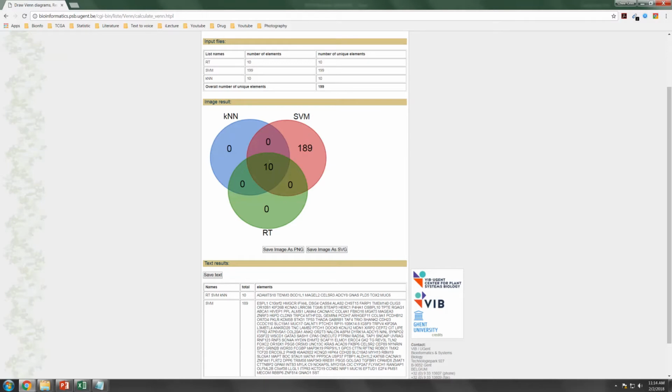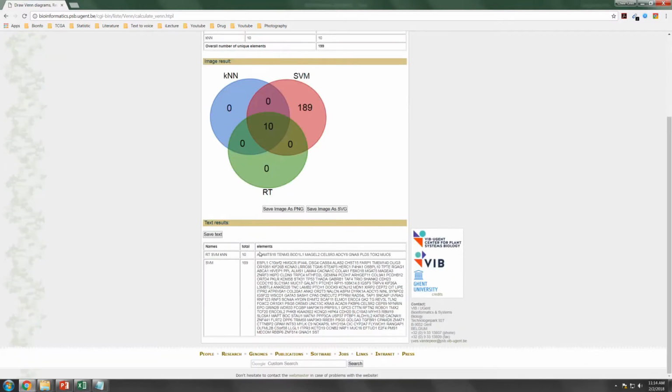So to choose those classifiers that are most stable, we will choose based on this region here, where these are the classifiers predicted by the three models. So this is the set of genes that we might be interested in, to see whether they have any biological function that might explain why the tumor with these mutations is not responding to gemcitabine.